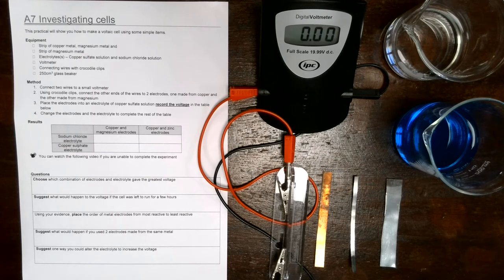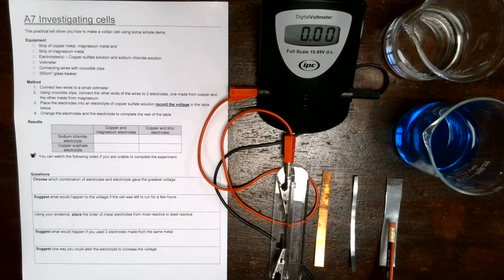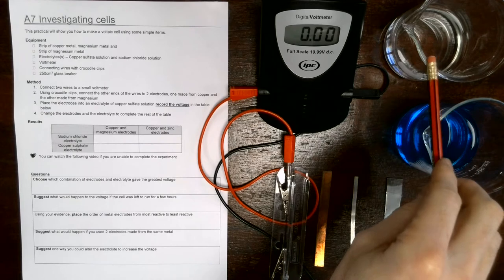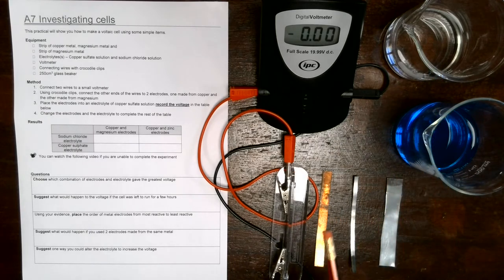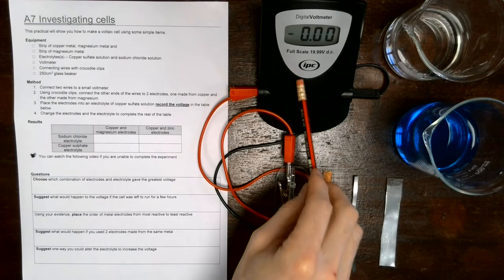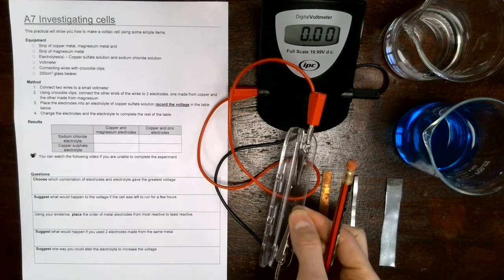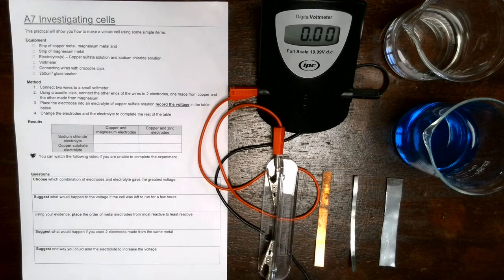We're going to use three different metals. I've got some copper here, we've got some magnesium, and we've got some zinc. I've got two different electrolytes in these beakers: sodium chloride solution and copper sulfate solution. I've got a digital voltmeter which is connected with two wires to some crocodile clips and a holder which you're going to use to connect the electrodes.